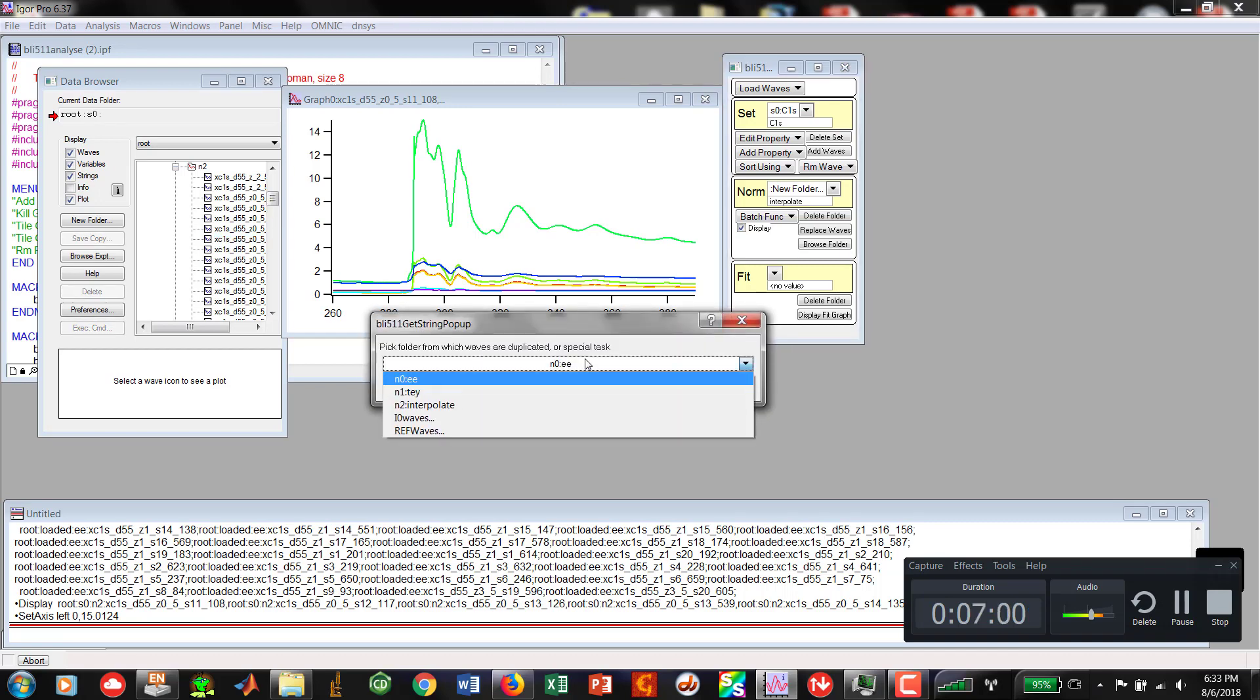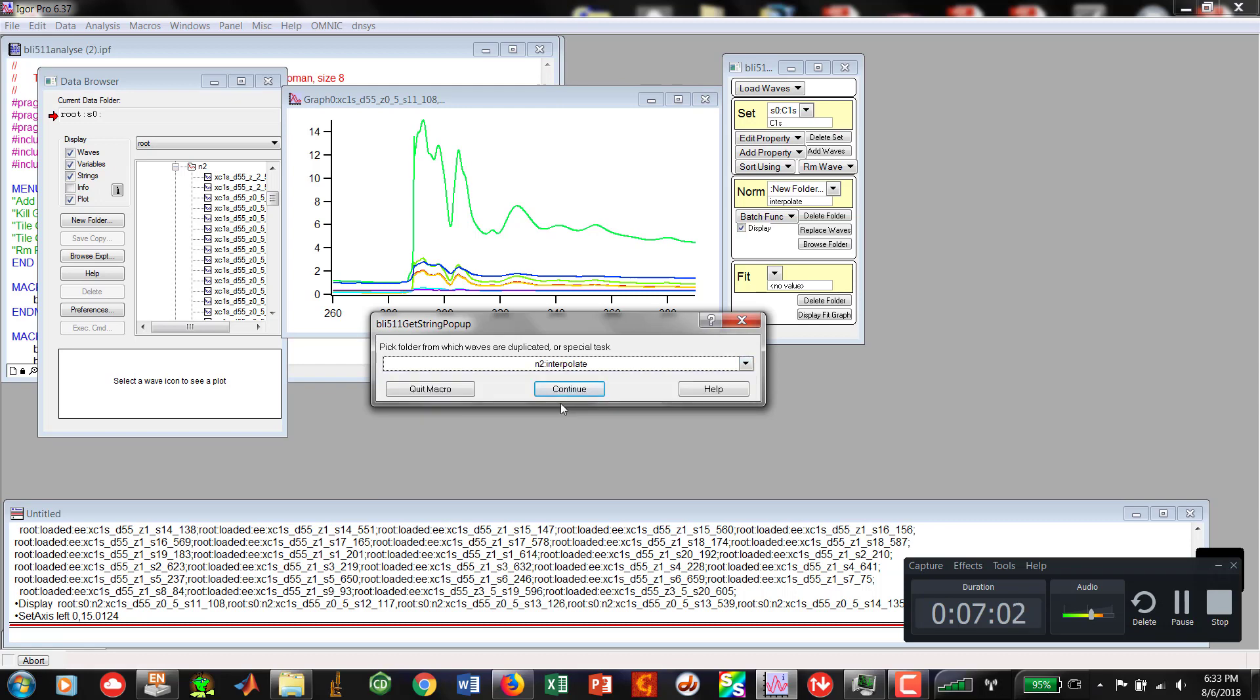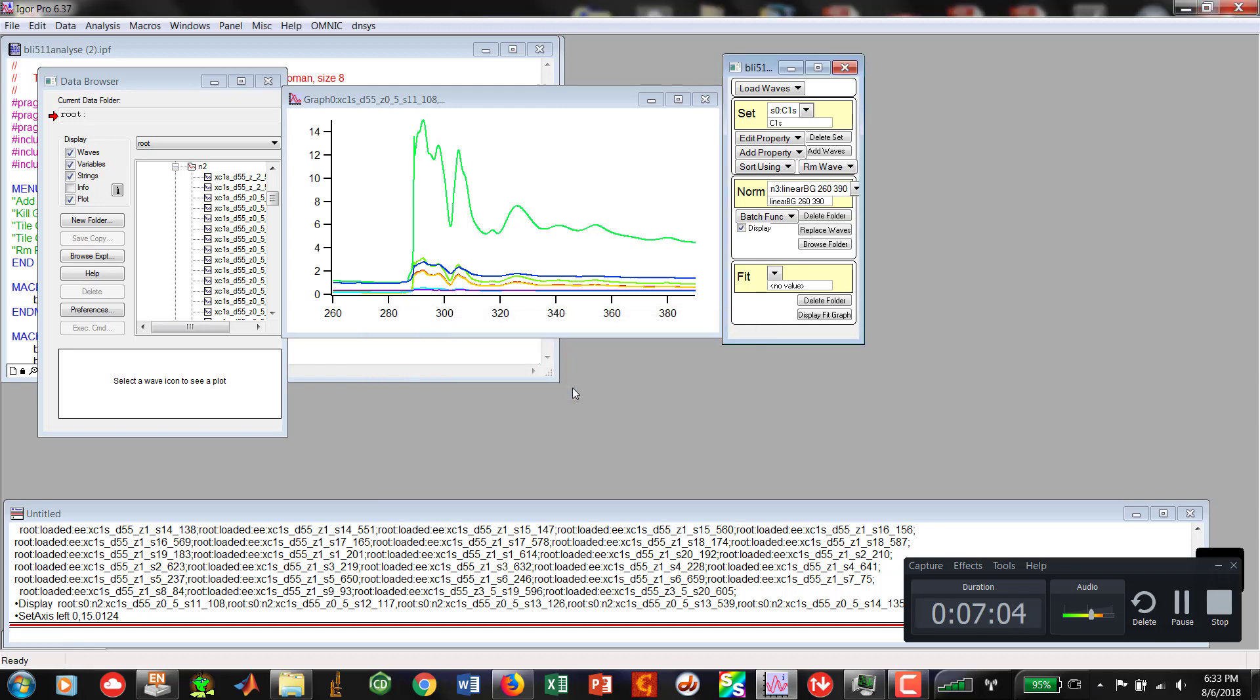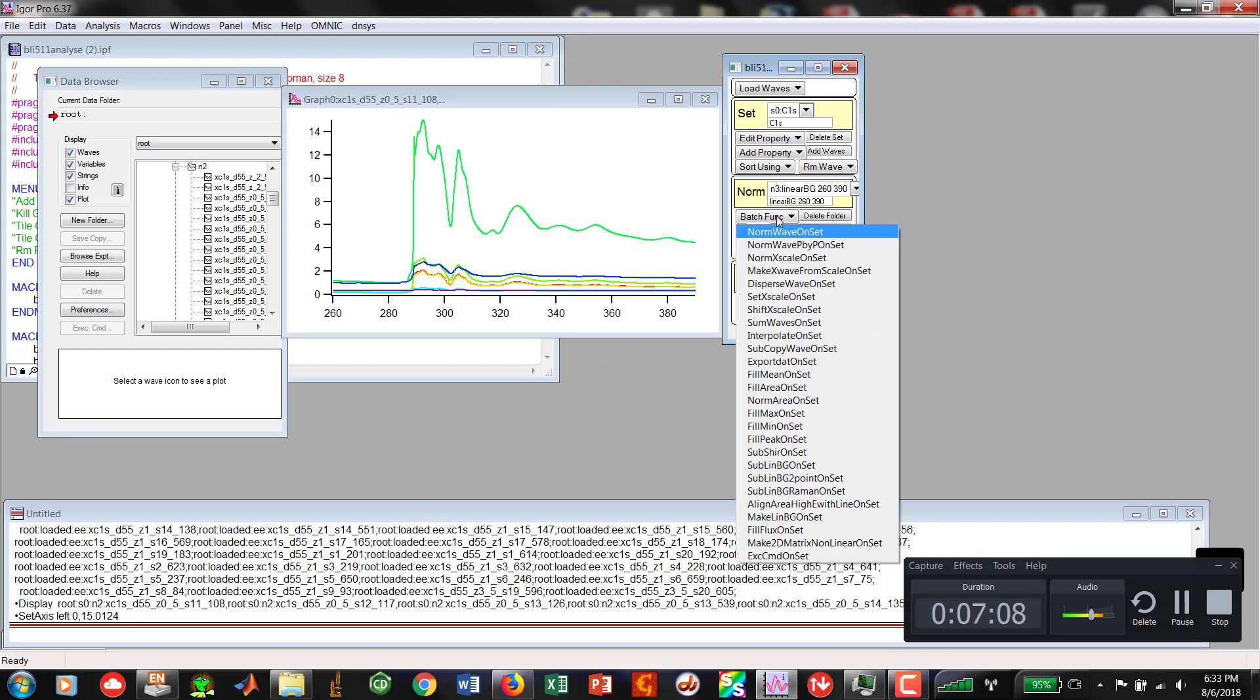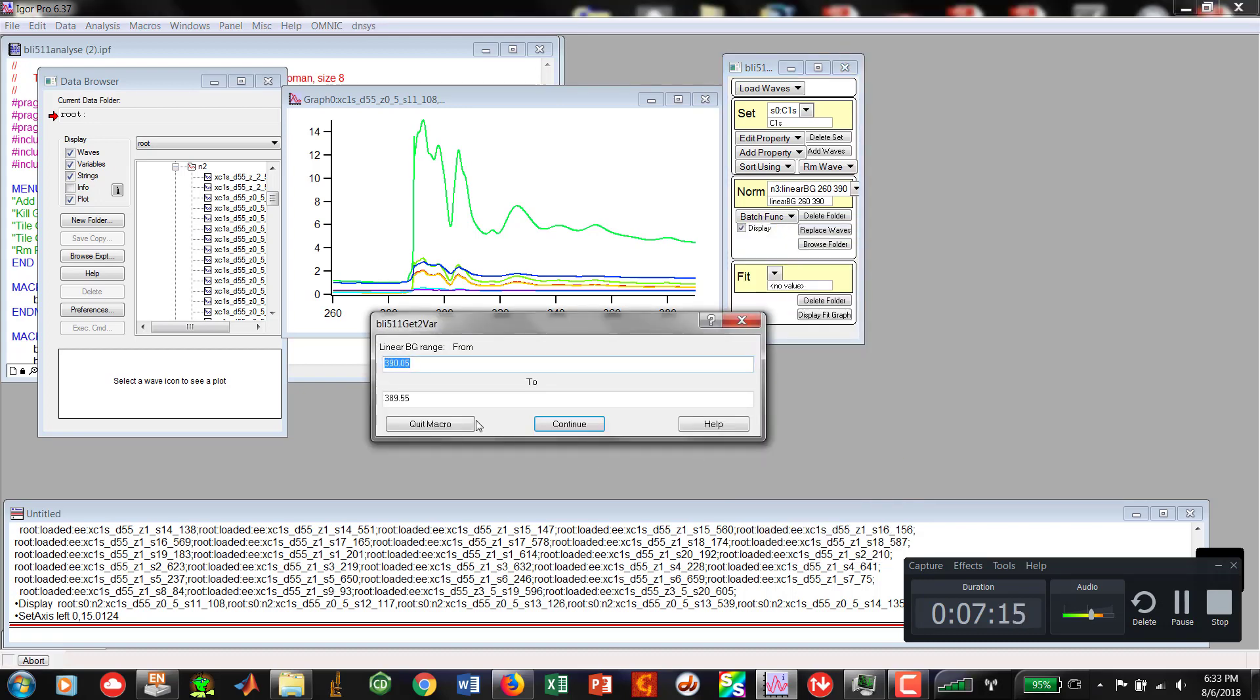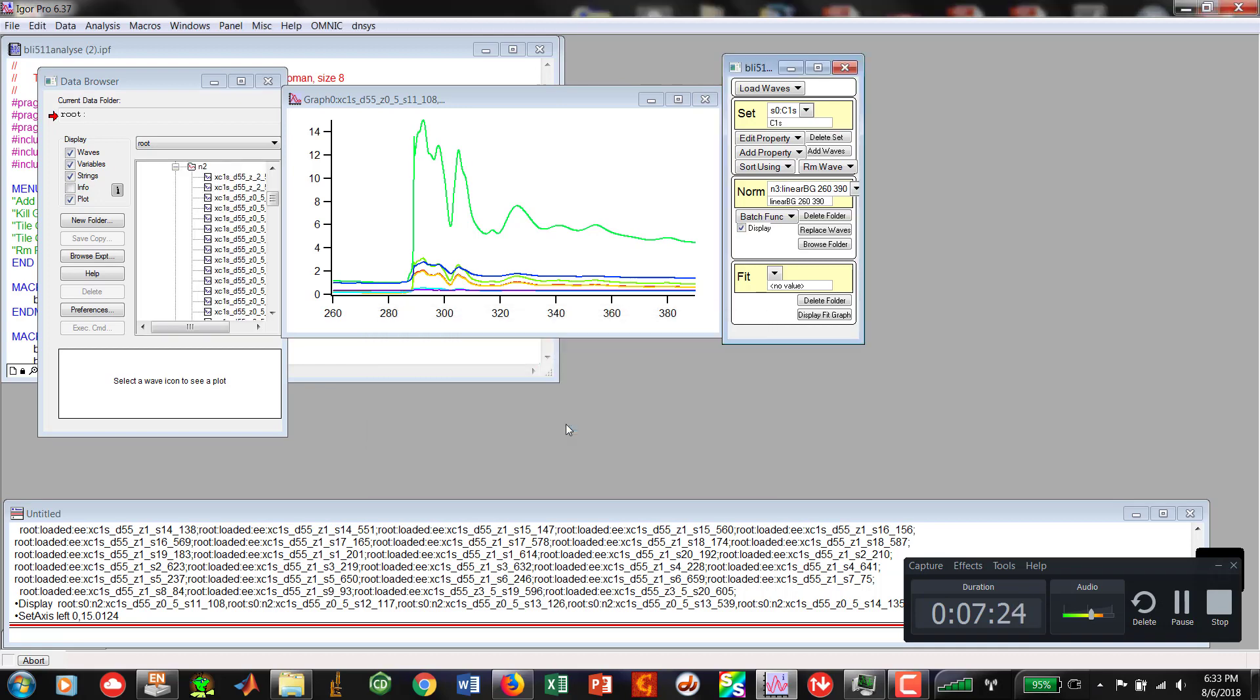Now the work is going to be done on our interpolated data. I hit Continue. Now I go into Batch Function after I've created that guy and now do Sublinear BG Onset. The linear background is going to be from 260 to 390. We hit Continue.